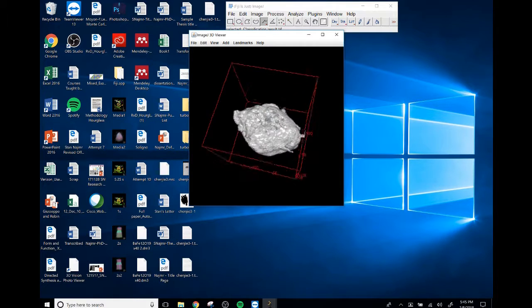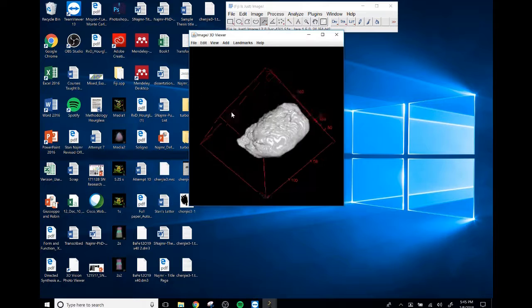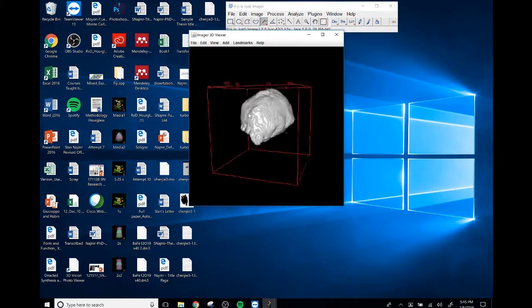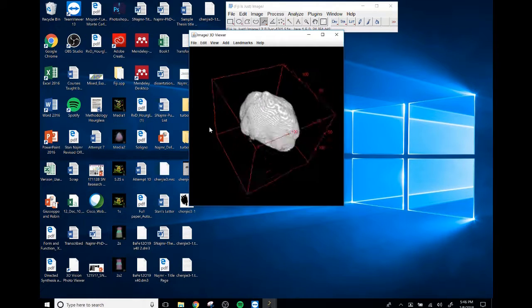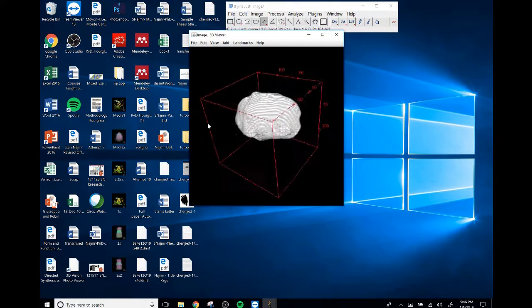And these corrections are also being made to the classification file. So I recommend saving your classification file first in case you make an error in one of these removals. All right, so there we go. Here's the particle. And now what we can do is make a quick video of this.